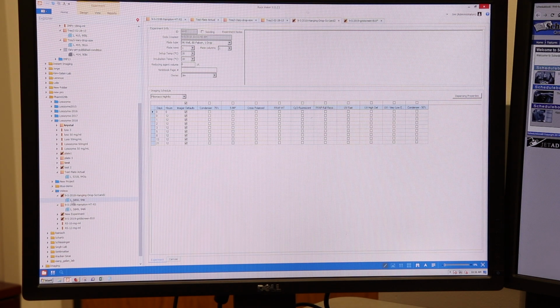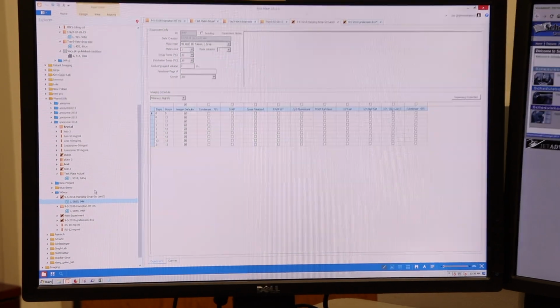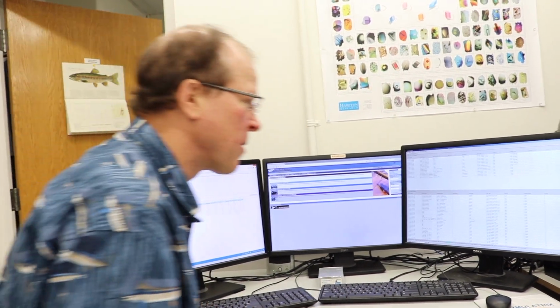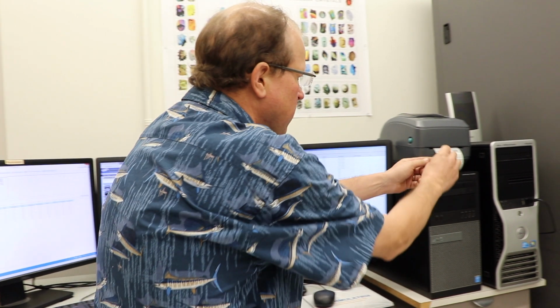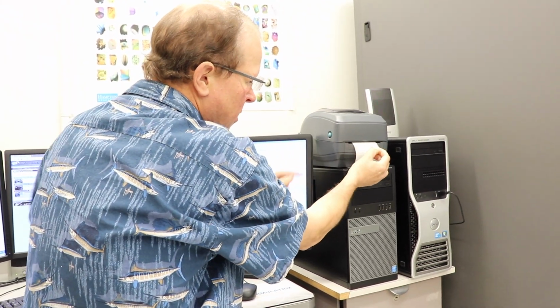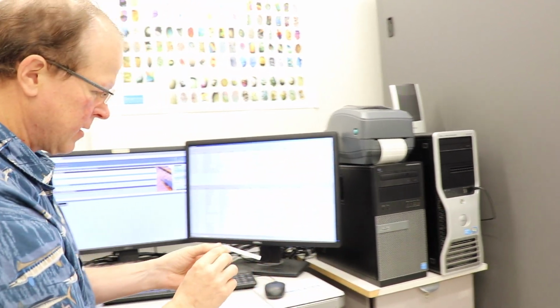You can see here, the little tab popped out again. Now this is plate 5850. I'm going to click barcode. And at that point, we'll get the plate ready to go into the imager. Okay, so we've just printed a barcode for our hanging drop inspector. We'll go over to the barcode reader. Again, carefully remove the barcode, leaving the extra tab behind.